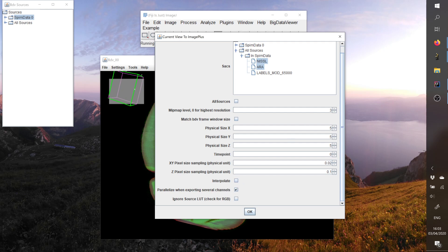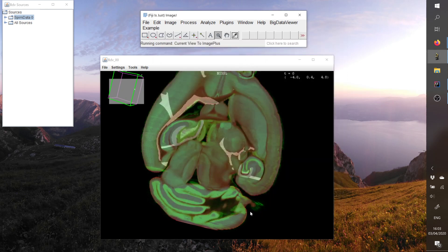If I do not want to get some interpolation to really see the raw data, I can do this. And this will be nice because here I think we choose a MIP map level which is very high, so we should see really the block of the pixels. And let's do this.